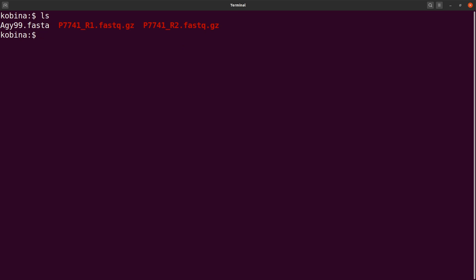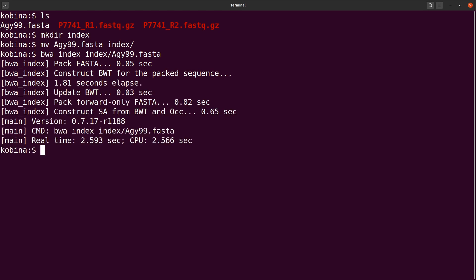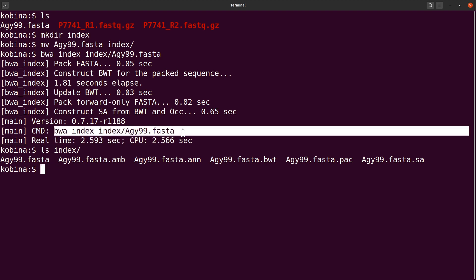Before we do the mapping, we need to first index the reference sequence. Indexing helps programs do a faster lookup. Let's create a directory called 'index', move the reference sequence there, and then run 'bwa index index/agy99.fasta'. Once indexing is done, if you do an 'ls' inside that directory, you'll see that in addition to the FASTA file, additional index files were created by BWA.